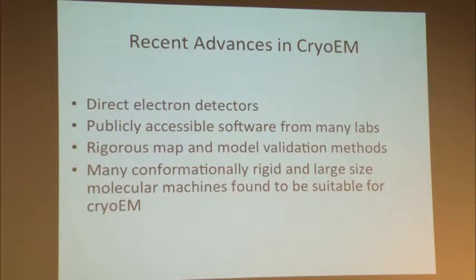And then, where's the specimen? It turned out a lot of these high-resolution structures were actually done in collaboration with protein crystallographers, because protein crystallographers have a lot of very good specimens that cannot be crystallized, or with different forms, where it is much more challenging to do crystallization. So I think these technologies turn out to be a paradise for crystallographers, not because they fail to do things, but because they just use an additional tool to enhance the information content.